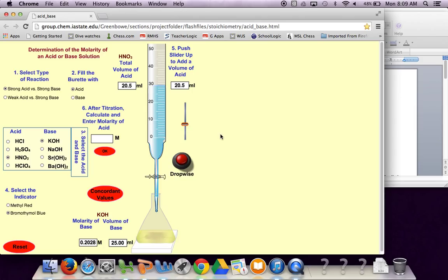So I went to yellow. That was actually a little bit too much. I want to get to a nice green color so there's no way to undo this.